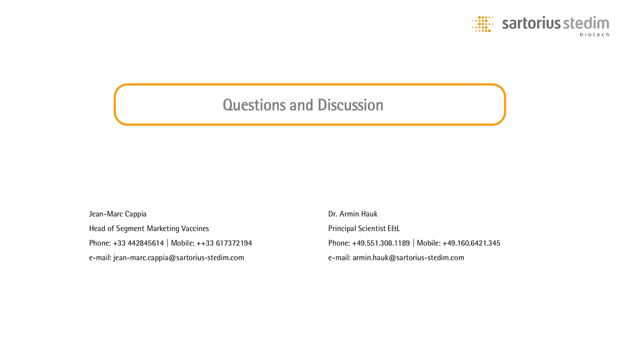Okay, great. So does this approach apply to your sterilizing filters or only to bags? No, of course we are applying our method to bags and to filters as well, also to tubings and connectors and all the other things. So we have a matrix where we define the different extraction conditions which are required for the different devices, and then we are testing all the devices according to our Sartorius approach.